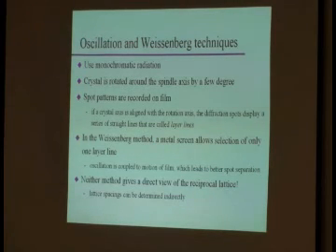Now, in most cases you'll just get something that looks like a mess. But if you align a crystal axis with this rotation axis, then you will actually get a series of straight lines of your spots. These are called layer lines. Well, that already tells you that in those days it was a pain in the behind to use these methods. You had to align a crystal axis with your rotation axis. Okay? If you have a big crystal that gives you some pretty faces, you might be able to figure it out. If not, life can be difficult. Okay? You try around until you get those layer lines.